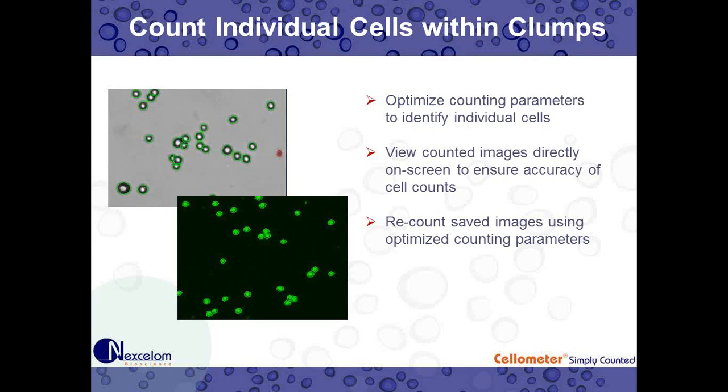And we can also recount saved images using optimized parameters. So if you have a new user who's imaging, as long as their images are in focus, you can go back and pull up those images, adjust your settings a little bit, and recount.